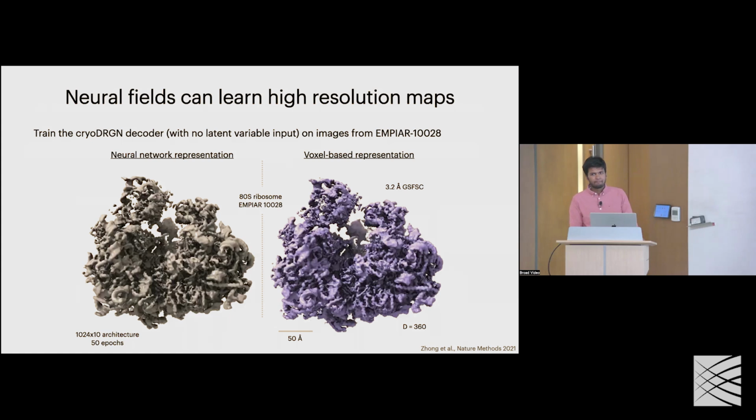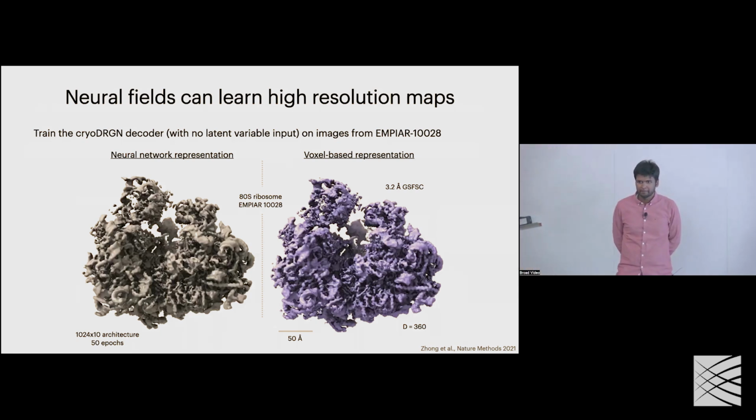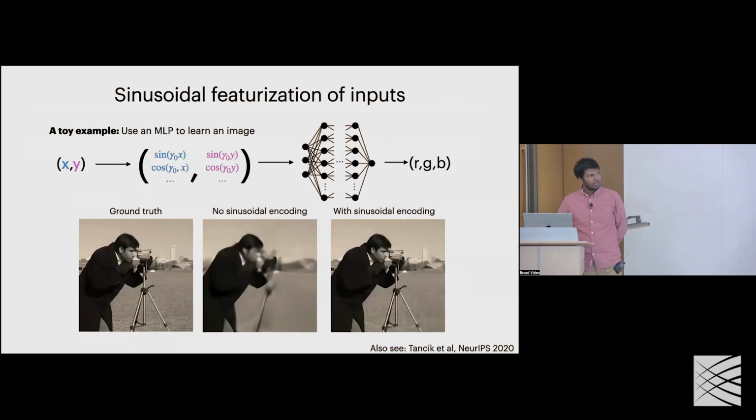Is the positional encoding equivalent to a Fourier transform of the point? Essentially, to do a Fourier transform of anything, you take the sinusoids and cosines at multiple frequencies and just add them up, right? We're not adding, we're representing the amplitudes of the components of the Fourier. So it's like a Fourier spectrum instead of a point. Is that a fair way to think about it, or am I missing something?